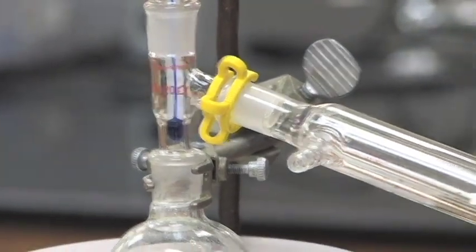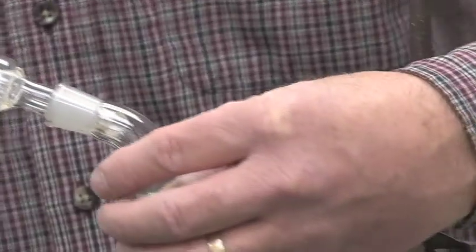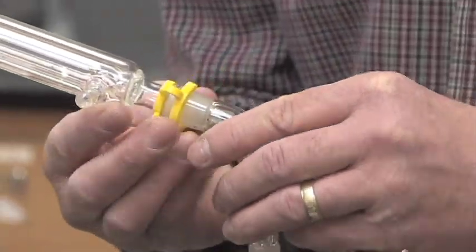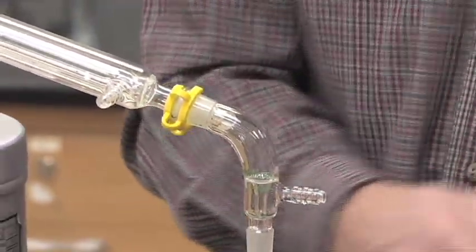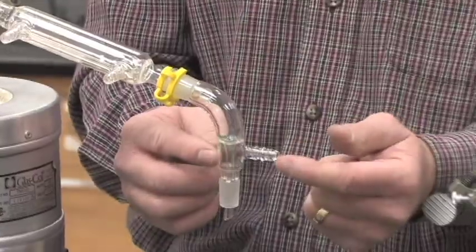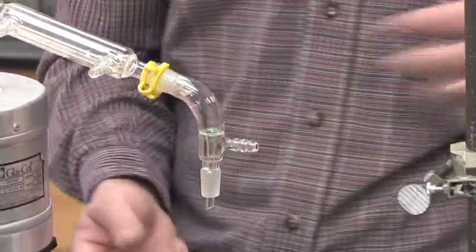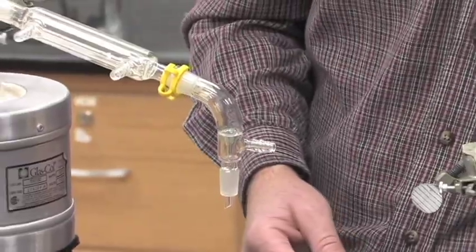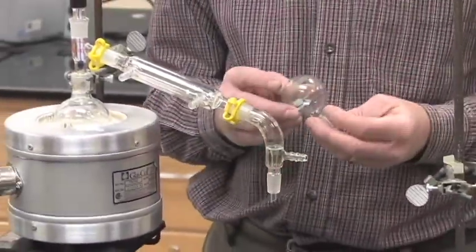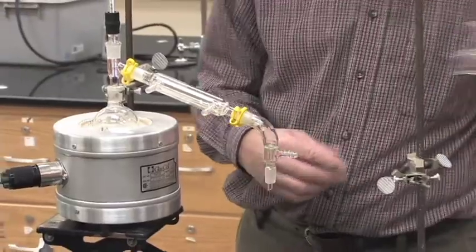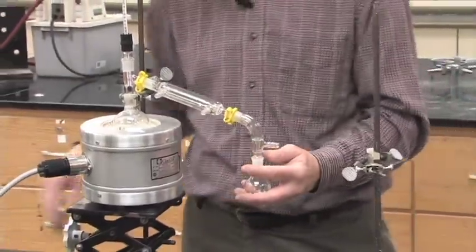And then we'll have another adapter on here at the bottom of the condenser and these adapters look different. There may be the side arm on the outside or it may be on the inside of the glass, it doesn't really matter.